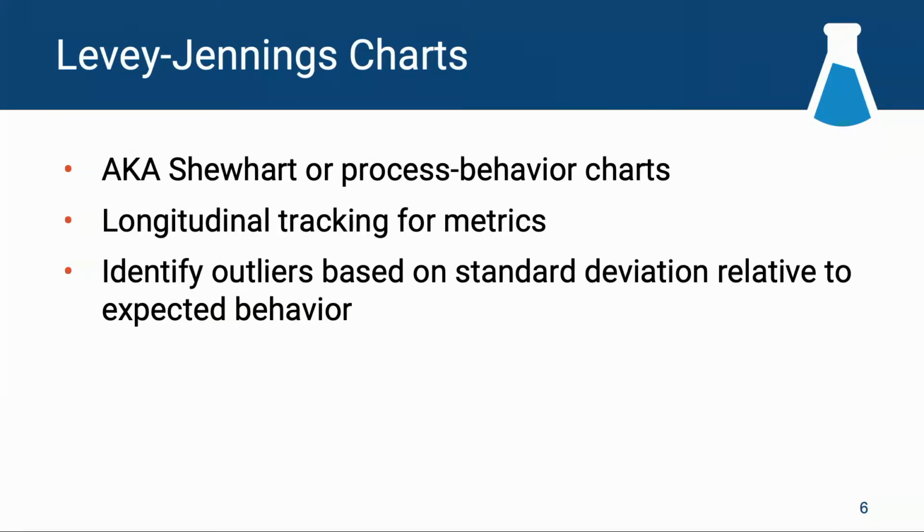But on to the more general purpose tools that are built in, and hopefully some of these are things that you might be able to apply to some of the data that you've already imported to LabKey. Or maybe you haven't been importing your QC runs, you've only been importing your actual unknowns, your experimental samples, and maybe there's some value in capturing all of that data inside of your LabKey assays.